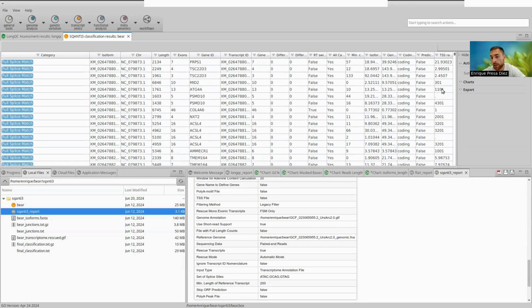If for example you have something very low, maybe 1, the coverage inside and outside the transcript is very similar, so you cannot really be sure that that transcript has been registered by the short reads experiment. So you cannot rely on that transcript.